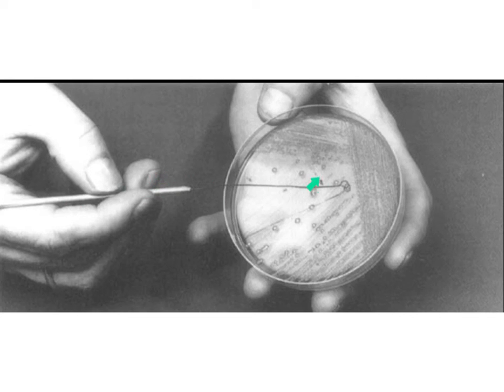Or you can take this flame loop and touch an area of the agar where there's no growth and make sure that there's no sizzling. The first thing we do is find one colony and scoop up one individual colony.